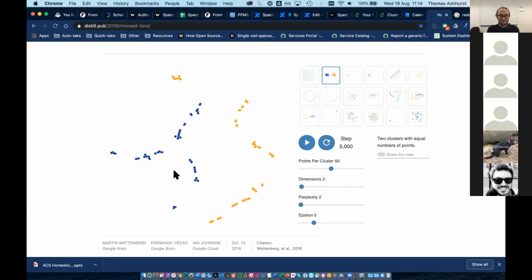Now this doesn't really represent anything meaningful. It's essentially collecting noise and interpreting that as a difference. Now, as far as the computer is concerned, it's accurate, right? Like it doesn't know it's noise, it's just showing difference. We, I guess, know it's noise because we can interpret that. And biologically speaking, this is the same thing. So I can ask t-SNE to pull this apart in more and more detail. If these were cells, I could go, are these meaningful differences or is this just noise in the data?